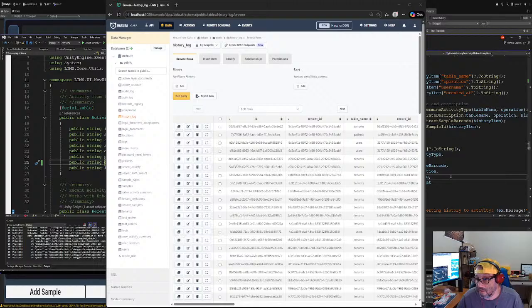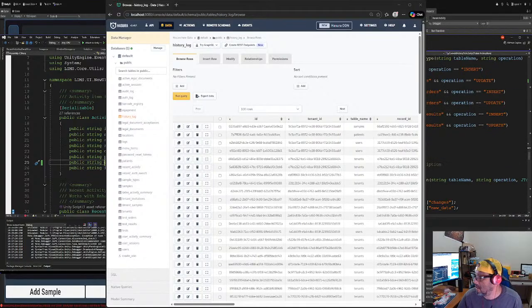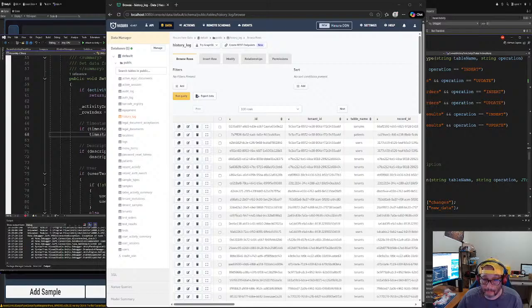How's that? Yep, we got it. Perfect. Any other errors? No other error. So we're looking for the errors here because we changed the name to created at, since there is no timestamp. So we have to fix it.